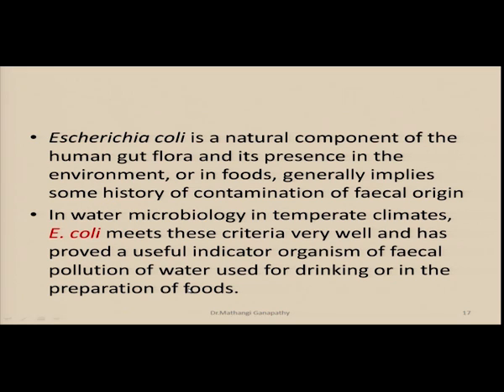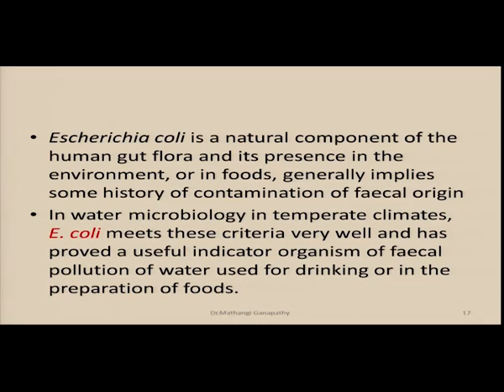So the quality of drinking water, as I said, is normally assessed by looking at how many CFUs of E. coli you get when you plate it. You just take a sample of water, dilute it, have your plating medium, plate the water concerned in appropriate dilutions and incubate it. Then look for the colonies which grow up in each dilution. Depending upon the number of colonies, you can assess whether the amount of E. coli present in the water sample is normal or higher than normal. If it is higher than normal, it indicates that there is a mixture, that it is contaminated.